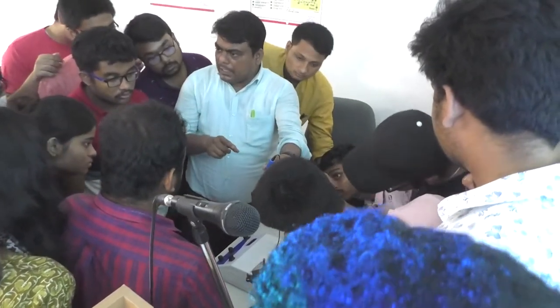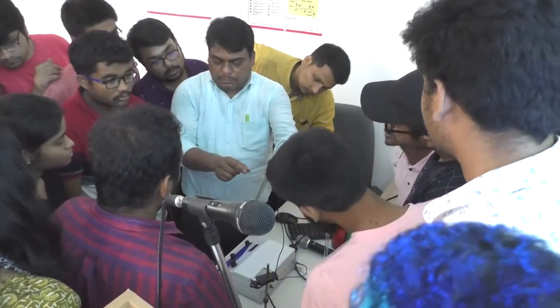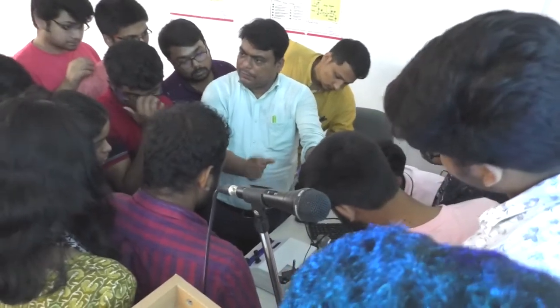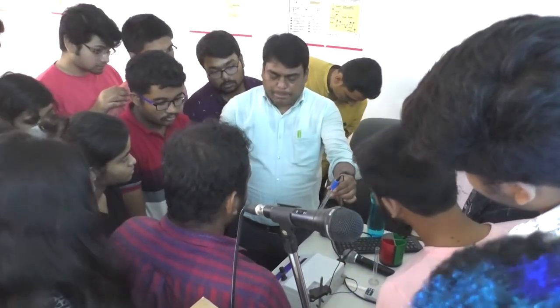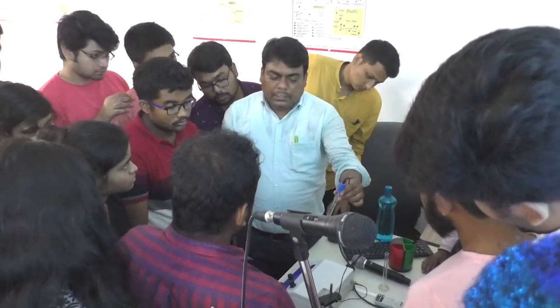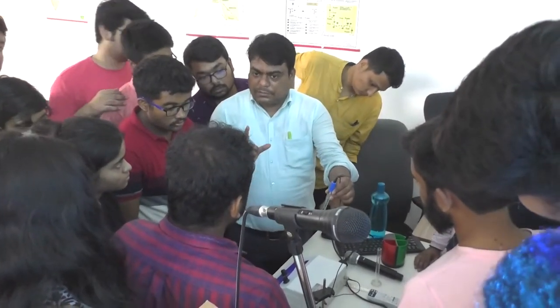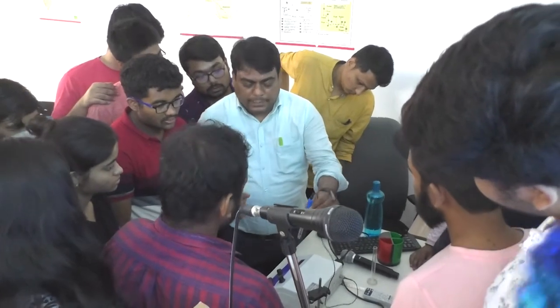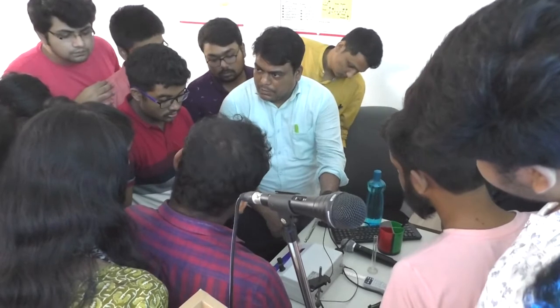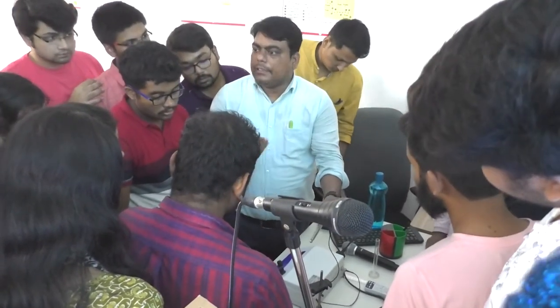ग्लास इलेक्ट्रोड के ऊपर आपको क्या करना है, एक आपको बुक्स में डायग्राम बनाना है इसका पूरा, एंड मेंशन द पार्ट्स, मेंशन द नेम ऑफ दिस वायर एंड द कंटेंट, दिस इज योर होमवर्क. सो द नेक्स्ट स्टेप इज व्हाट, यू हैव टू डिप द सॉल्यूशन इन स्टैंडर्ड सॉल्यूशन फर्स्ट, यू विल गेट 4.0 सॉल्यूशन. हियर सम ऑफ द रीडिंग्स आर कम्स लाइक 4.8, 5.8, 6.8.